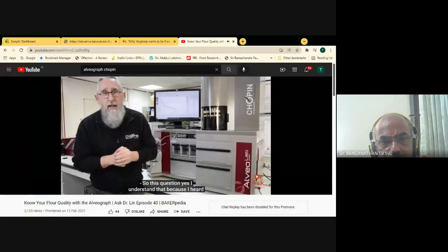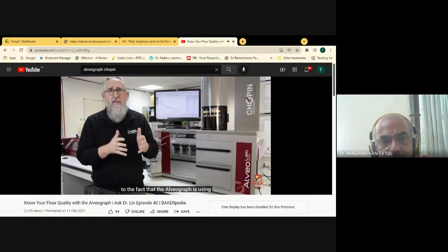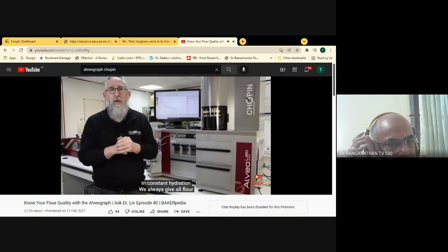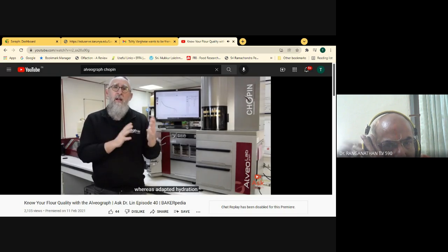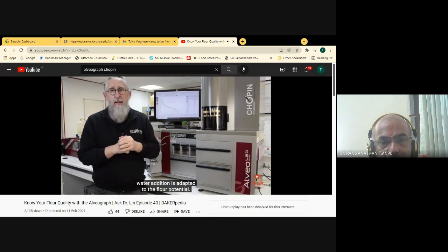Yes, I understood that question because I heard that many times. Basically, people are referring to the fact that the alveograph is using a constant hydration protocol versus other devices which are using adapted hydration. In constant hydration, we always give both dough the same amount of water, whereas in adapted hydration, the water addition is adapted to the flour.